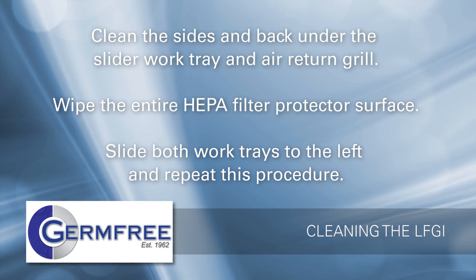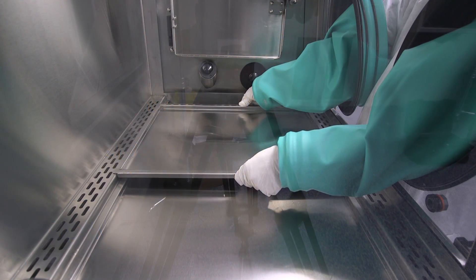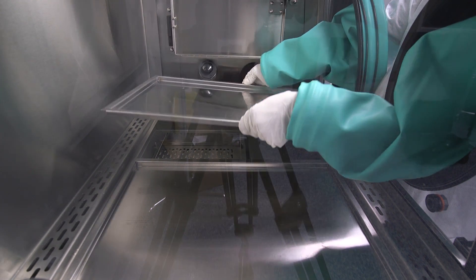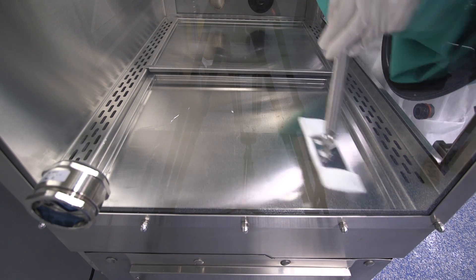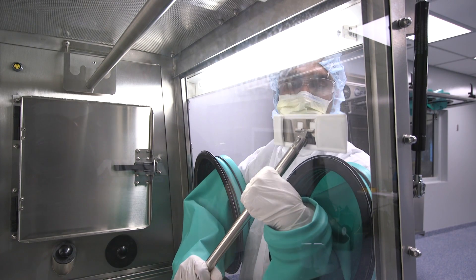Wipe the entire HEPA filter protector surface. Slide both work trays to the left and repeat this procedure. Sliding work trays are removable for cleaning if preferred — simply lift them out and place them out of the way. Avoid spreading the contamination that is being removed. Clean the sliding work tray, including all inside and outside edges. Slide the clean tray to the side and repeat the procedure on the other tray. Clean the inside of the window and the window frame.